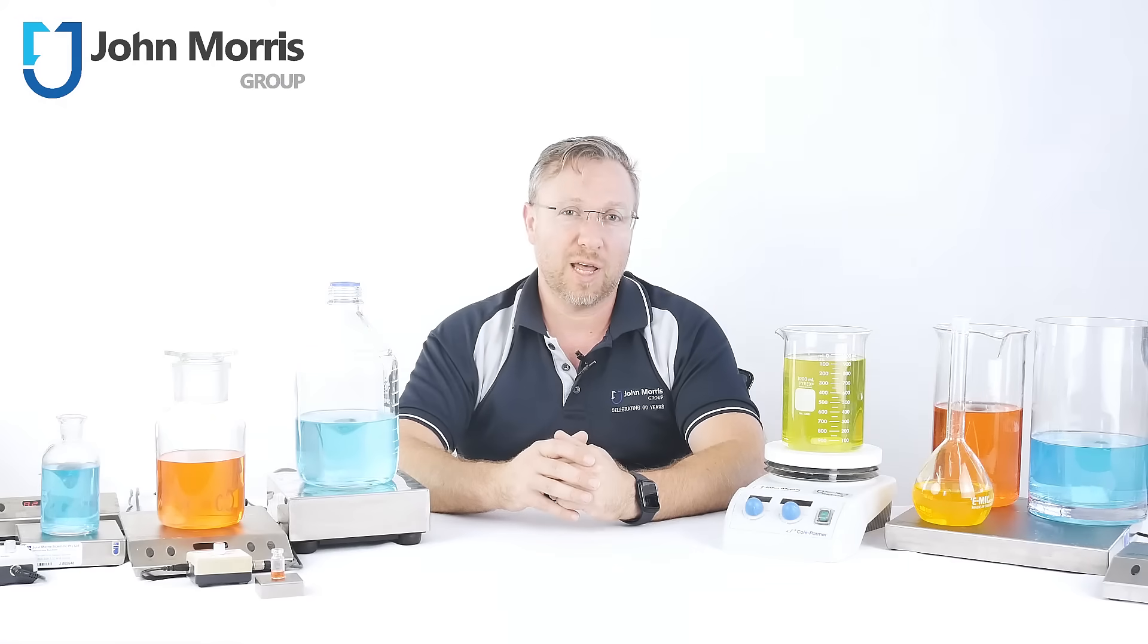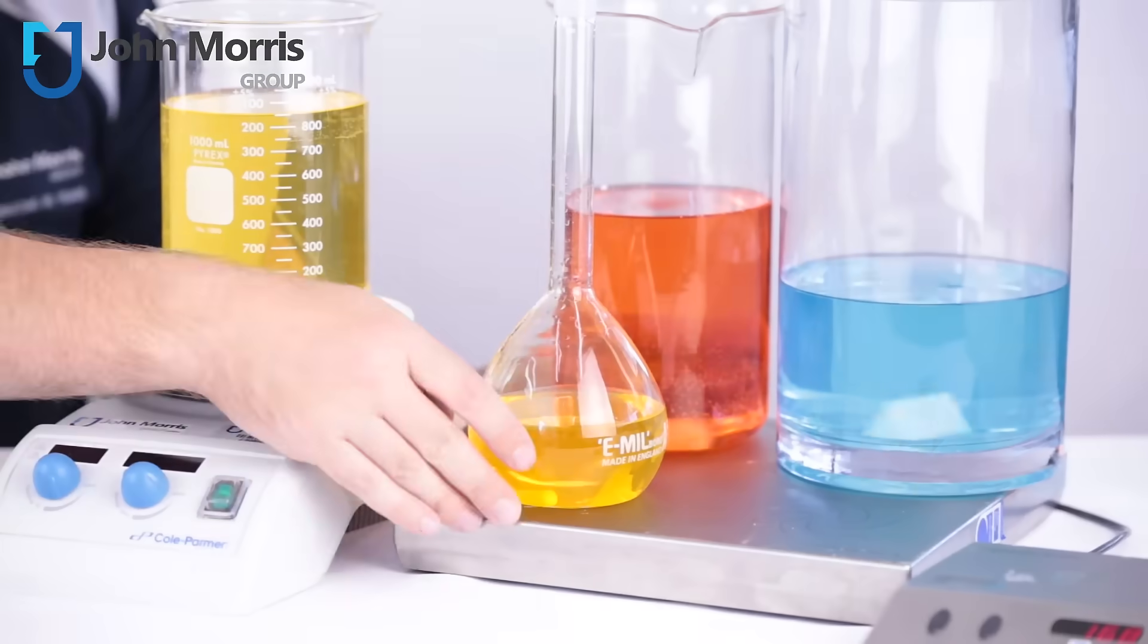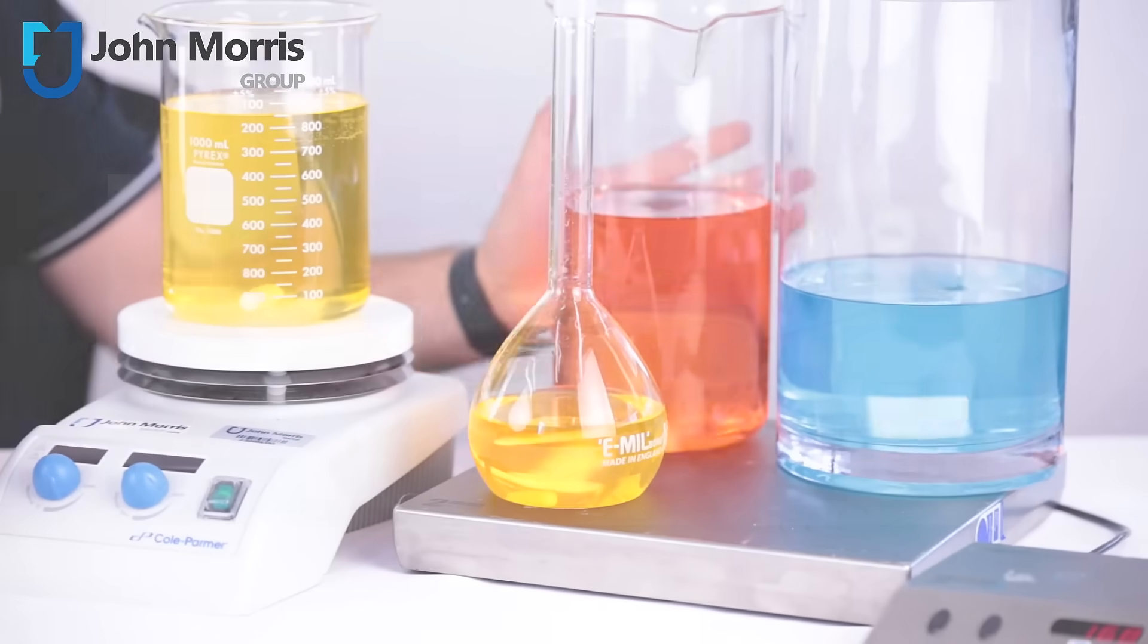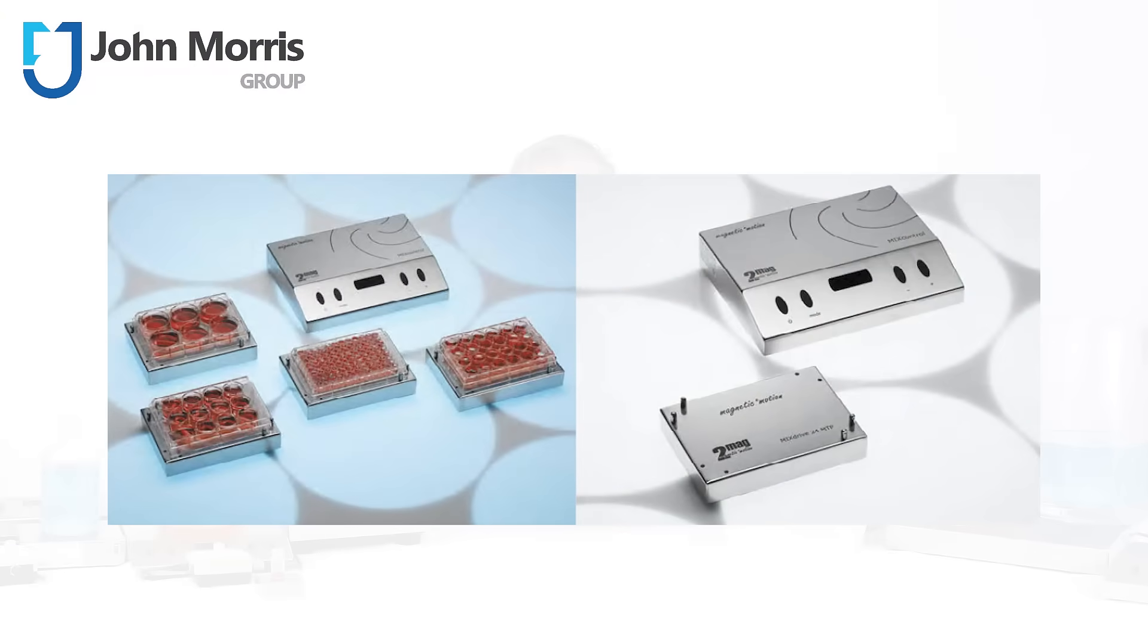2MAG also have a range of stirrers to handle high throughput environments, such as these multi-position stirrers, and they even have 96 position stirrers for microplates.